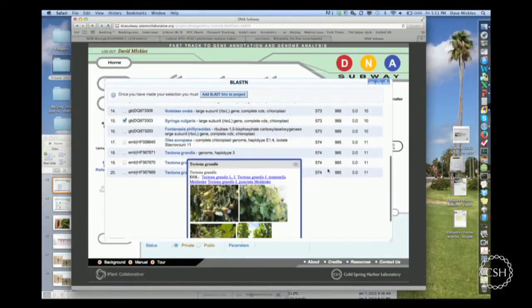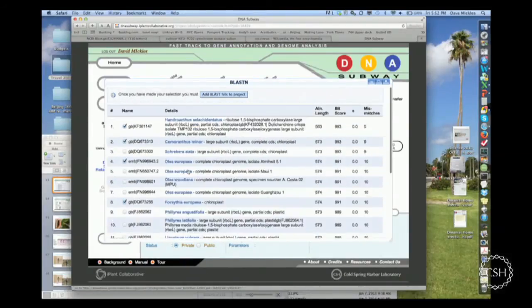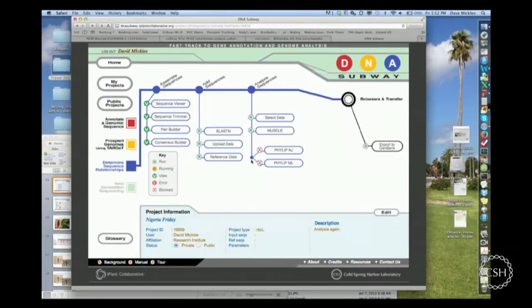No, I guess not. I forgot what that one's called. But I'm going to take that one. And again, what I've done is just take a selection of these plants and added them to my analysis. They're all there now. Great. So we're moving along. We'll just be a couple minutes beyond 5 because we lost that disconnect time.